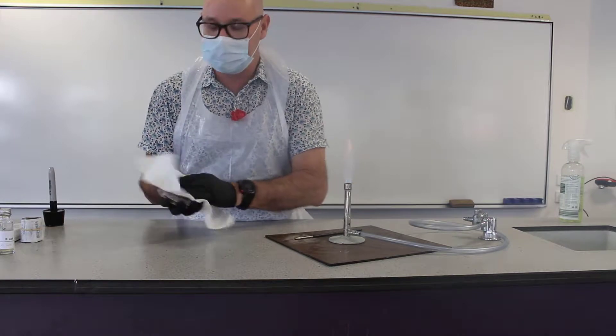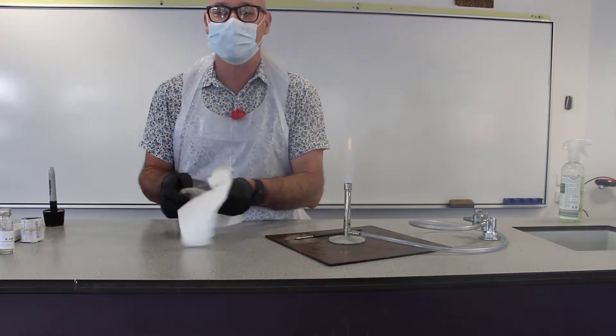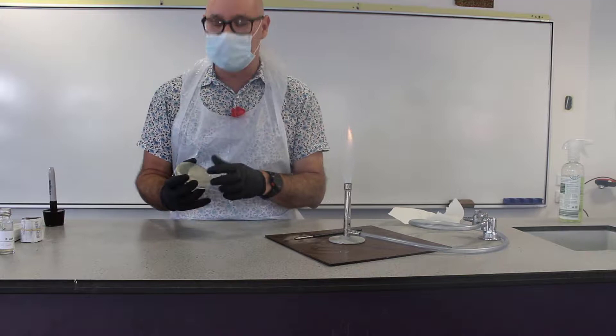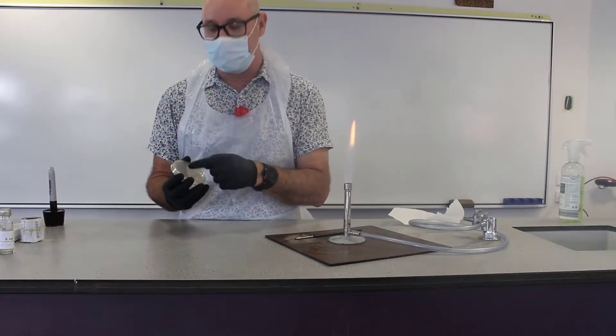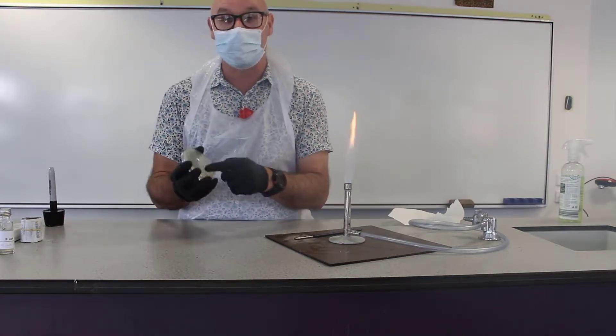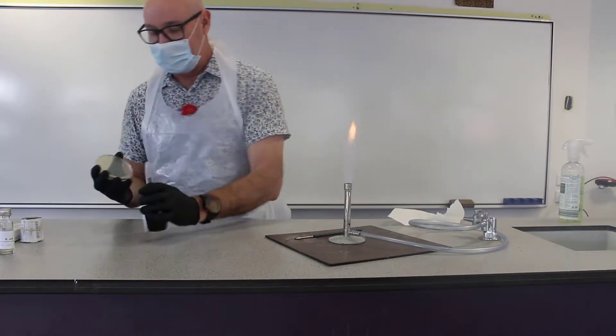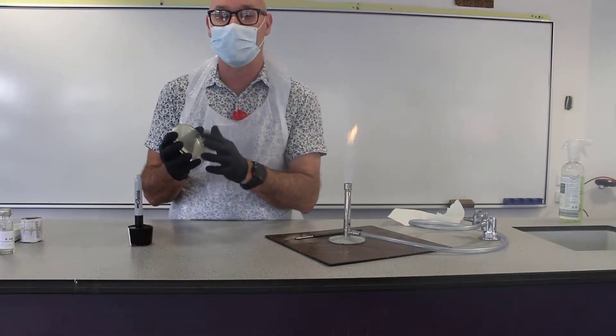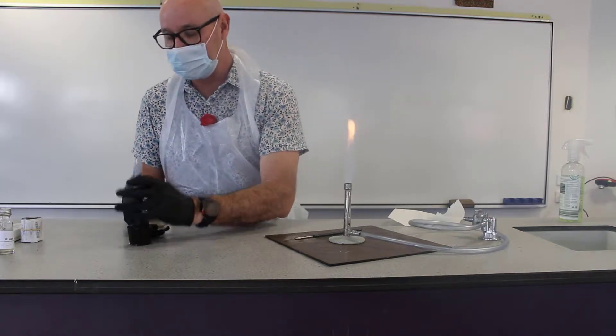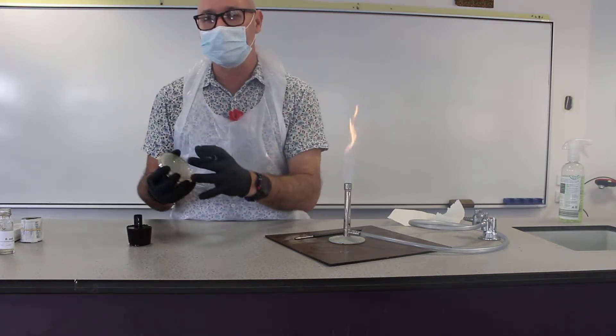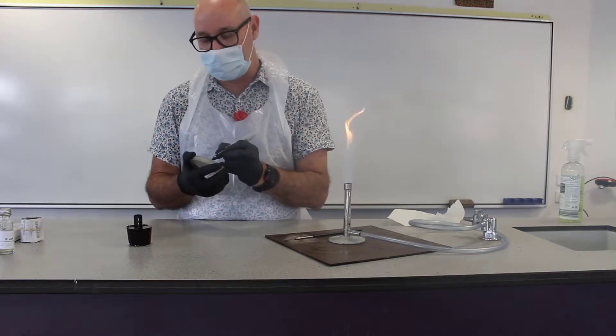The next thing we're going to do is label our agar plate with today's date, my name, and the bacteria that we're going to inoculate the plate with. It's important to use the bottom part of the plate just in case the lid could get mixed up and swapped around.